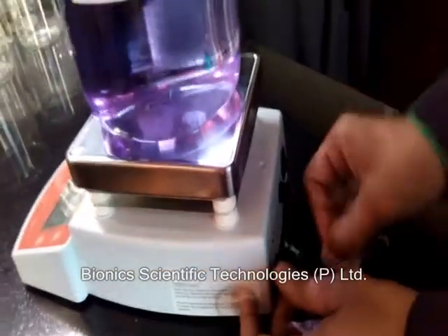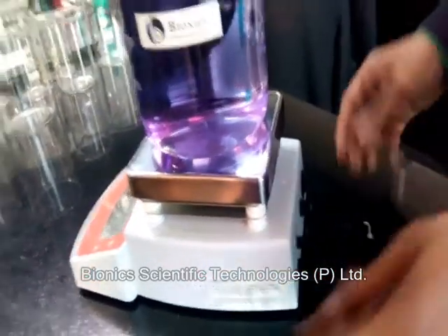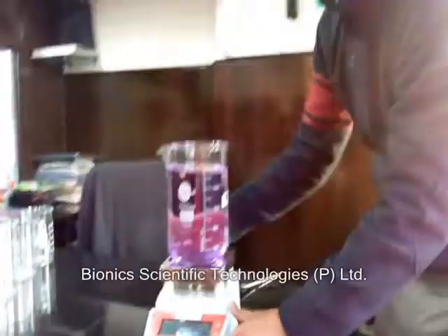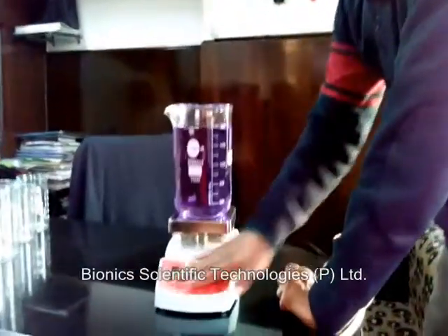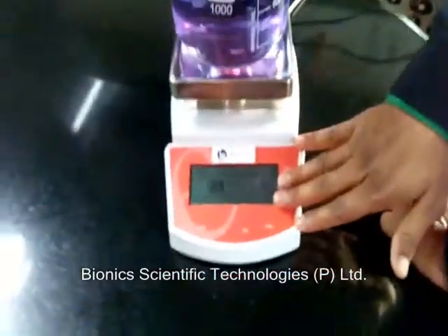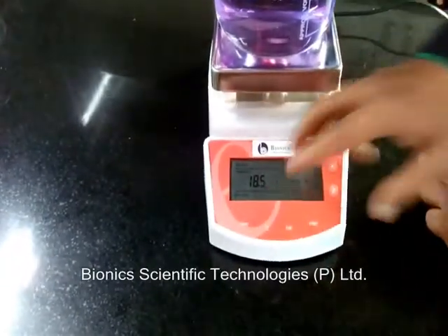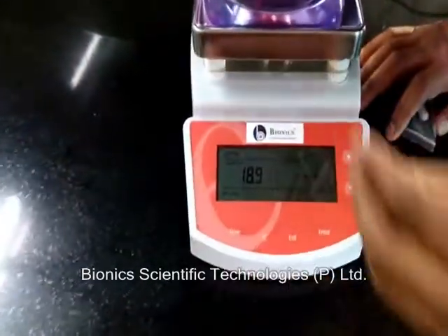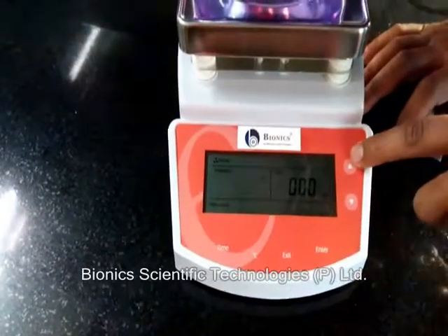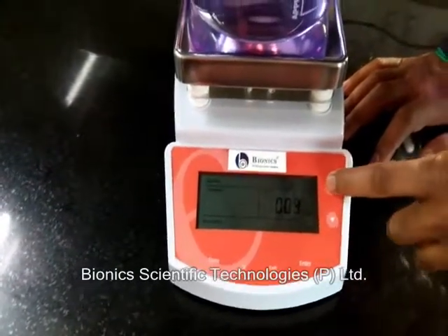We have to put the sensor for checking the temperature. This is the digital part of the machine. Here is the timer — if you want to set the machine for a certain time, we can set the time here using the up and down keys.